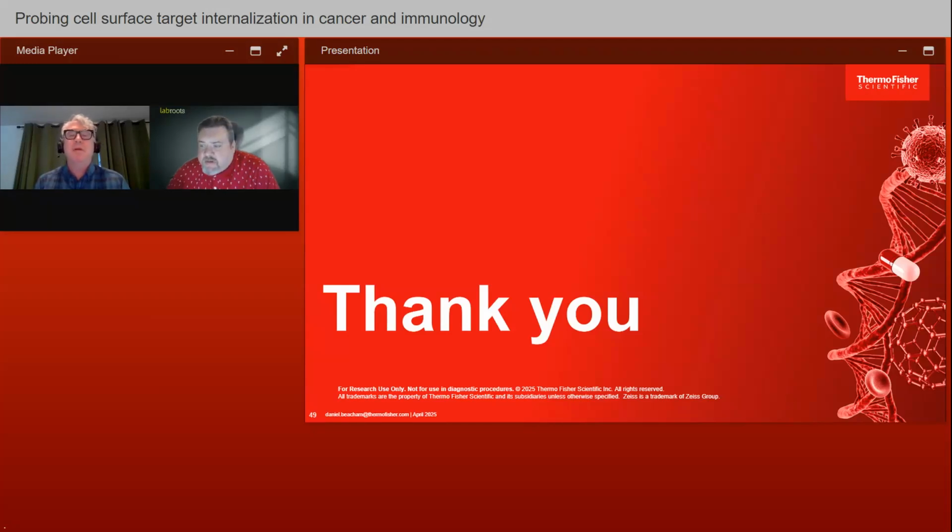All right. I've got time for one or two more. Let's go. Why are live cell conditions so important for analysis of ADC uptake and trafficking? Okay, so I showed a few time courses of activity. I showed one on the order of minutes or tens of minutes, and then another on the order of days. In particular, antibody degradation can take longer than its internalization. You may want to parse those, as both rely on the activity of live cells.